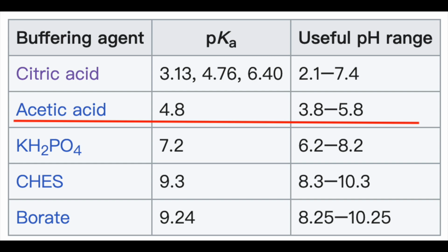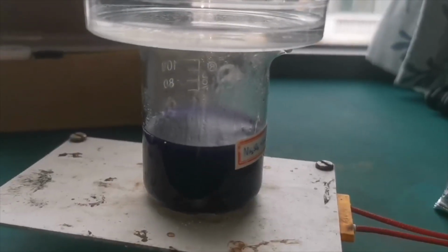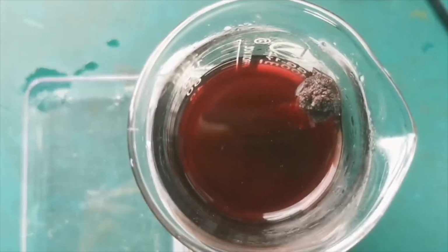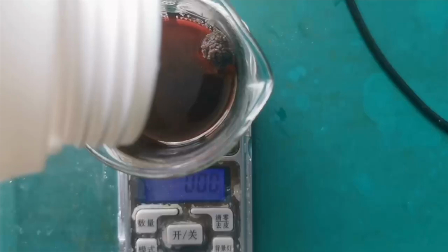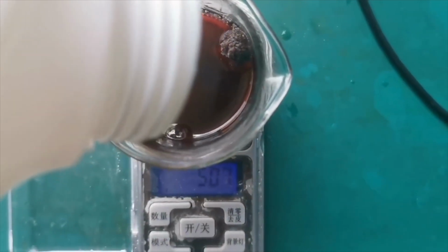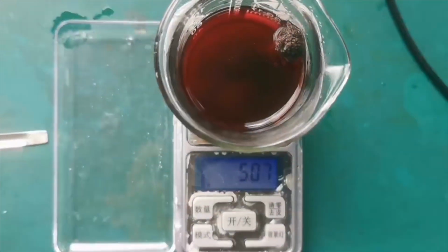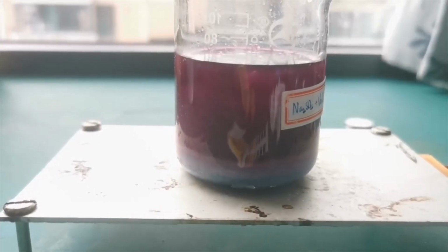After around 3 hours of boiling, the reaction speed of the hydrochloric acid solution slows down a lot. I took it off the hot plate, and as it cools down, the blue color was taken over by the dark pink color of the cobalt ions. I then added around 14 grams of sodium bisulfate monohydrate. This has two purposes: to boost the solution's acidity and to introduce sodium and sulfate ions. Those ions are necessary in the lanthanide separation step later. I reboiled the solution and allowed it to react.